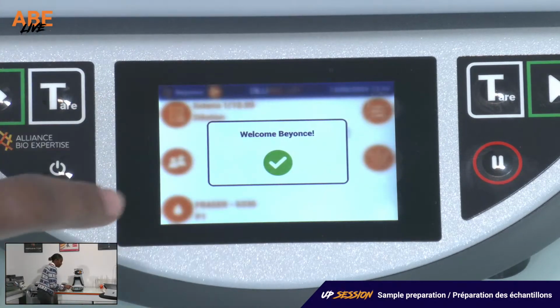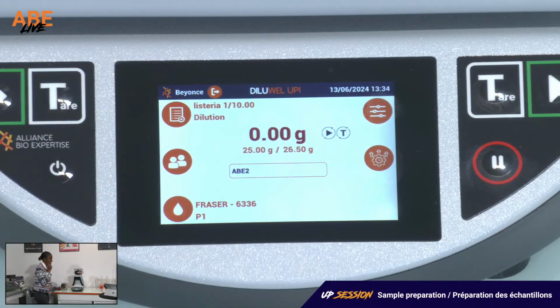In this user menu, I can create and manage my users to follow the traceability. If I connect myself, all the activity done on this dilutor will be linked to my user profile. The information saved are the cycles, the program used, the weight of each sample, the diluent that was dispensed, the tolerance, and all information regarding the cycle.